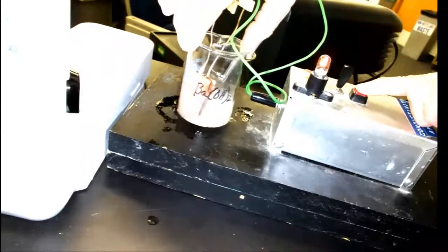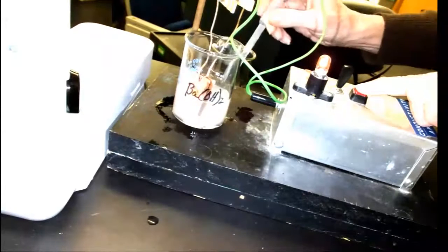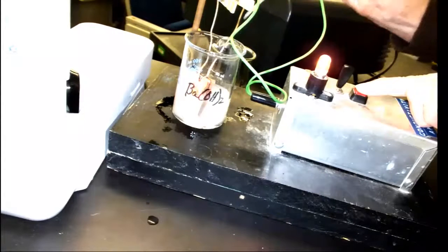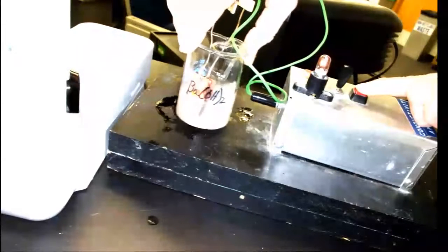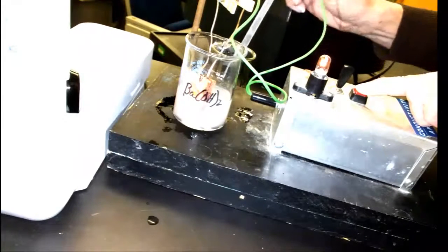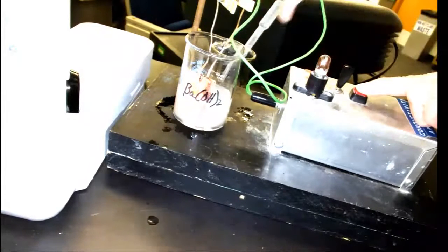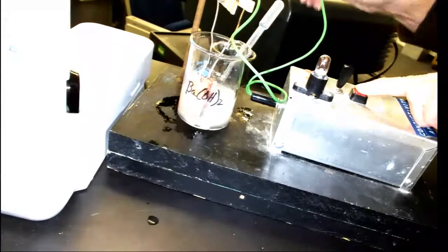Whoa. As I add enough sulfuric acid, it's reacting with the barium hydroxide. The light bulb's gotten dimmer. I think you can tell that. And I'll add a little bit more. As I add it directly on the electrodes, it's bright. But then as I mix it, not so much light bulb. It's getting pretty dim there. Keep going, and add some more right on the electrodes. It goes brightly, but look at that. The light bulb is all but out.